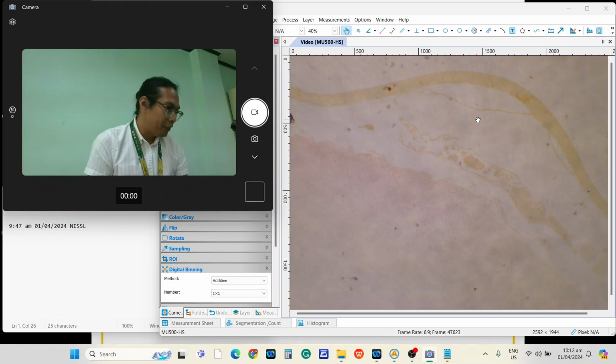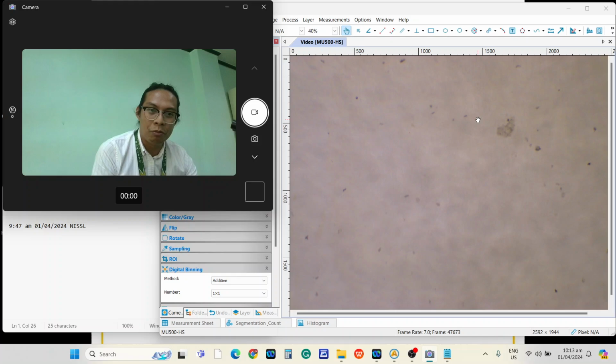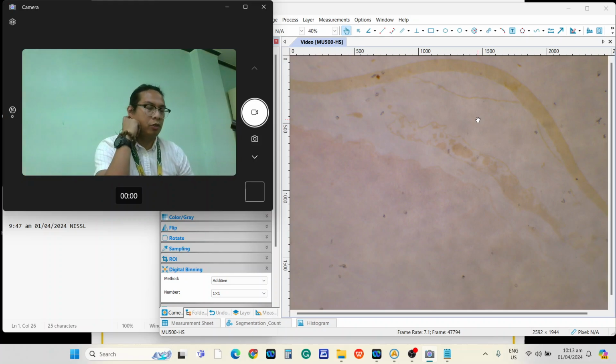Balik na tayo dito. Now, this is a spinal cord. Okay? Hindi na natin ma-appreciate yung mismong spinal cord. Yan yung meat ng spinal cord. Pero ito kasi yung may magandang cut ng meninges. Na-appreciate ko pa ang meninges. Okay, so these are the meninges. Diba? Na-discuss ko na din to sa anatomy. Diba? May mataba at may payat.